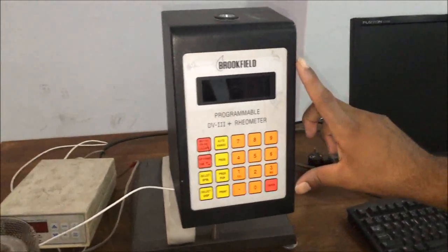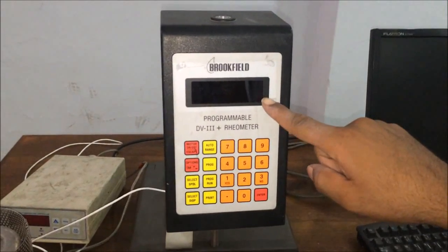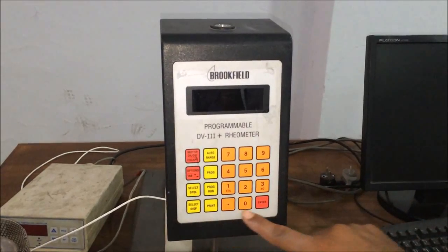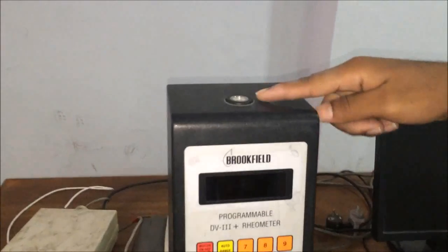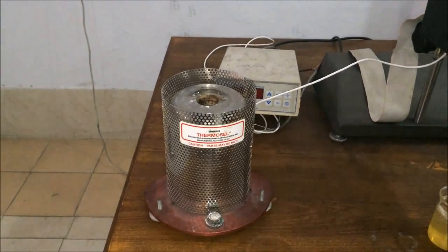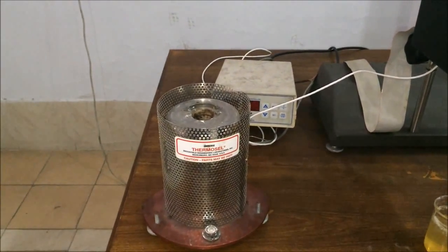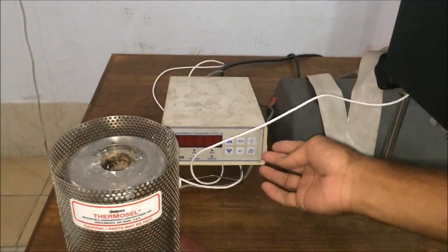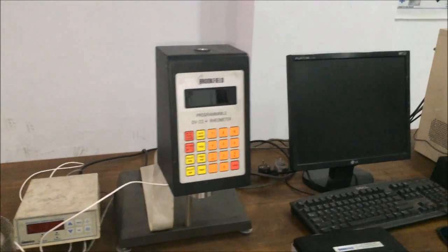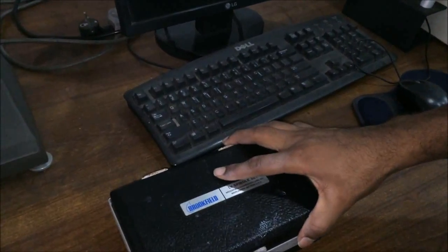On the front side you can see the screen that displays different readings, and these are the different functionality-based buttons. Here you can see the bubble level used for leveling the instrument. This is the thermosel, which is used to heat our fluid and measure its viscosity at different temperatures. This is the temperature control device connected to the thermosel, and here we have the LV spindle set.